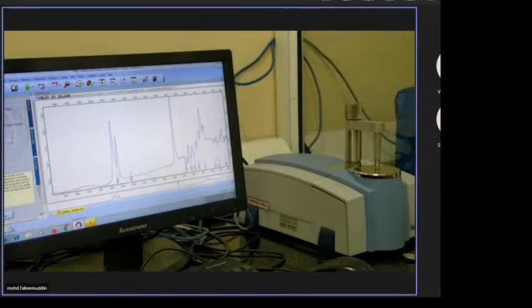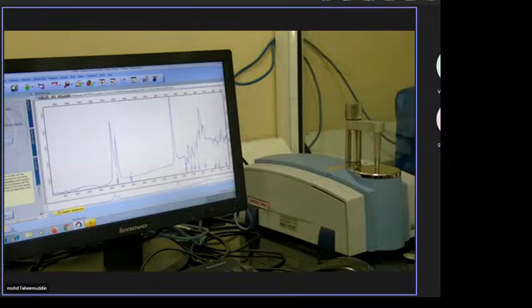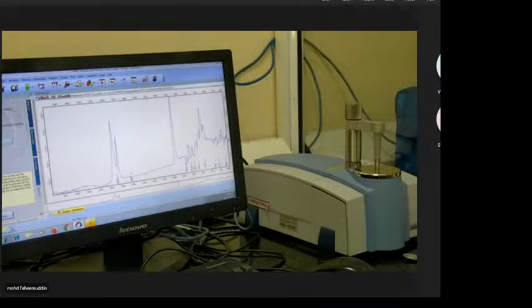UV spectroscopy involves electrons: sigma electrons and pi electrons. Each compound contains bonds, which are single bonds or double bonds. Single bonds are because of sigma electrons, and pi bonds are pi electrons. The other electrons are the non-bonding electrons, the lone pairs on oxygen, sulfur and nitrogen. These electrons usually absorb the UV light.